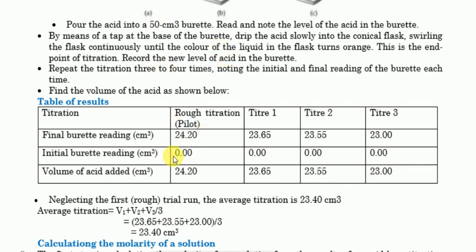So for example ilianza na initial volume, final volume ikawa ile pale, final volume ikawa ile pale, kuchukua hii kuminus kupata jibu ile hapa chini. Lakini it's not necessarily hapa angeweza kuanzia ngapi? Kuanzia hapa 24.2 angeweza kwenda hapa akaenda nayo huko, angetitrate mpaka volume fulani, let's say. Kwa it's not necessary kwa sababu 24.2 mara 2 haifiki 50. It's not necessary for you to add until again up to 0.